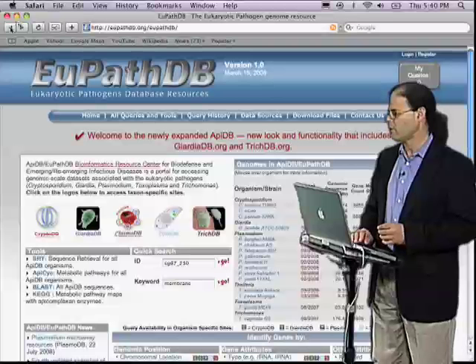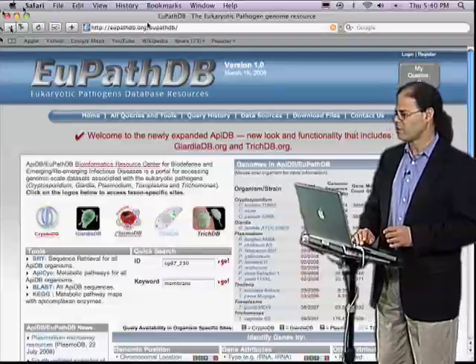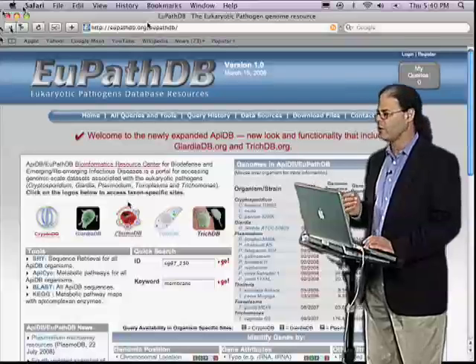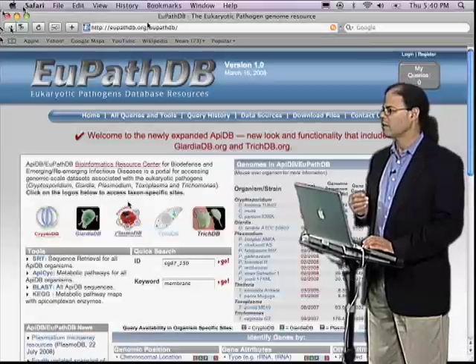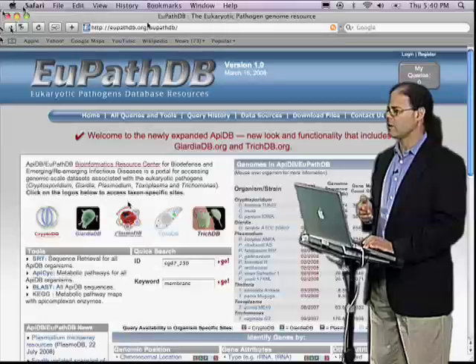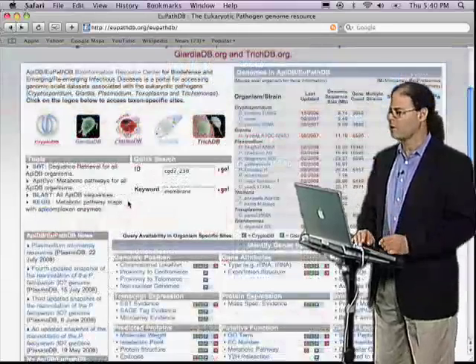I should also point out that this homepage also provides, in addition to links to some of these other pages, other bits of information. You might, for example, be interested in tutorials that highlight some of the features we'll be talking about. And further down the page here, you can see links to individual tutorials, links to publications, workshops, exercises, and so on. We can run questions across a variety of these organisms.